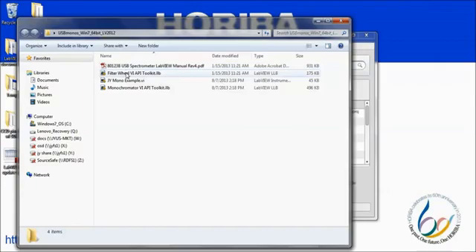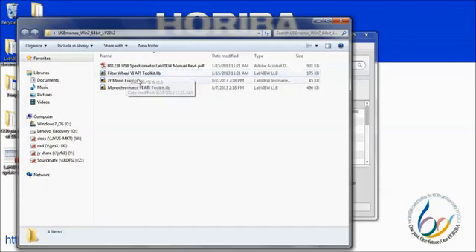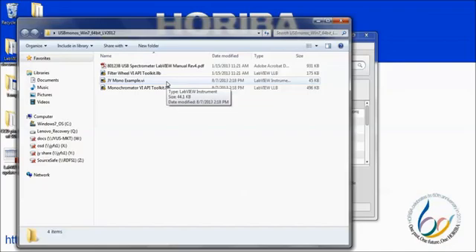Next, we have the filter wheel toolkit. If your spectrometer has an internal filter wheel, it can be controlled using this set of VIs. Next, we have a VI entitled JY Mono Example. This is a compiled VI that serves as a good starting point for developing your own code. It controls the slits, swing mirrors, turret, and wavelength.